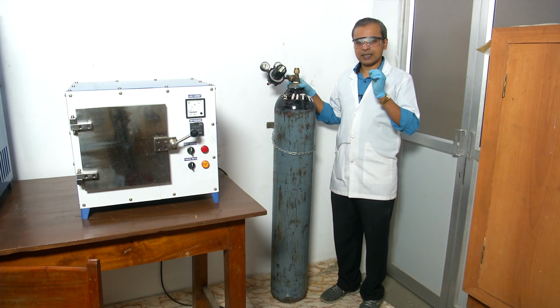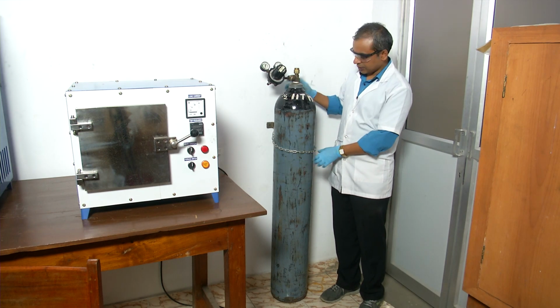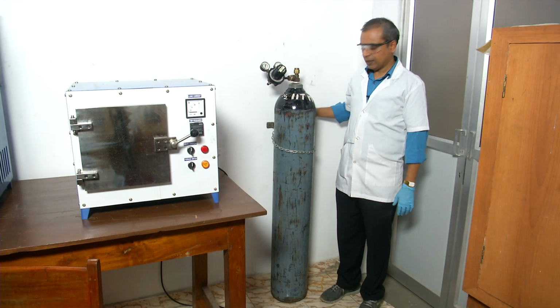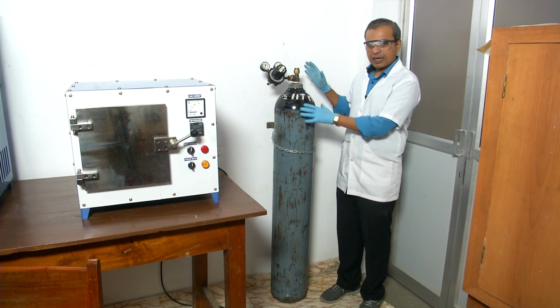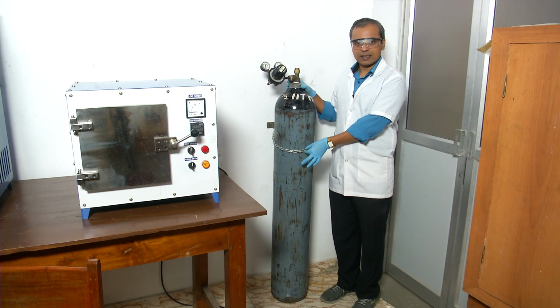So, a very important thing to do when you are dealing with gas bottles is to ensure that the gas bottle is restrained such that it cannot fall down. A simple thing that is done is to put a chain like this, so that it is attached to the wall. There should be a good securing system on the wall from which there is a chain that comes around and then goes around the gas bottle.